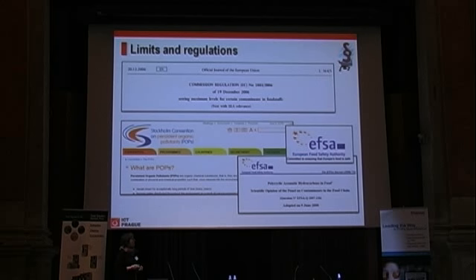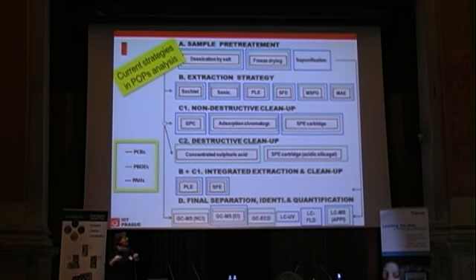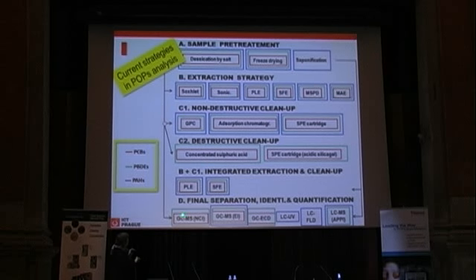When we started, the state of the art was like that. It may seem a little bit complicated, but when you start with our target compounds, with PCBs, PBDEs, and PAHs, and when you make a review of approaches, you would agree that there are really many. Regarding extraction, with Soxhlet and pressurized liquid extraction and so on. Regarding cleanup, again, a lot of approaches in different laboratories. And then the final determinative step, again, may be HPLC for PAHs and different versions of GC for chlorinated compounds. So this was the state of the art where we started.